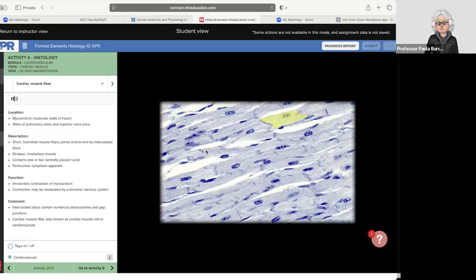That's going to be important to the function of the heart, and I'll talk about that when we get into the heart chapter, Chapter 19. And if you recall, there are special junctions in between adjacent cells, and they stain dark. There's one there. And those junctions are called intercalated discs. We'll talk about the membrane junctions that you find there, but those are going to be important as well for the heart to function properly.